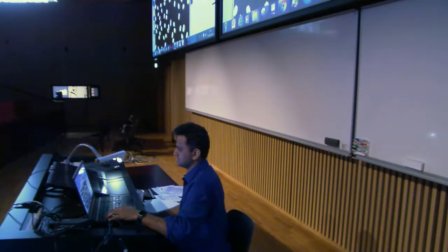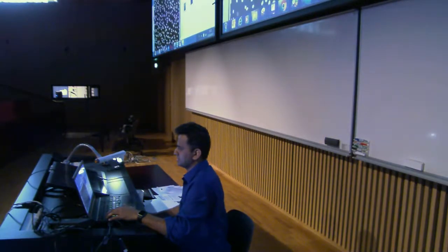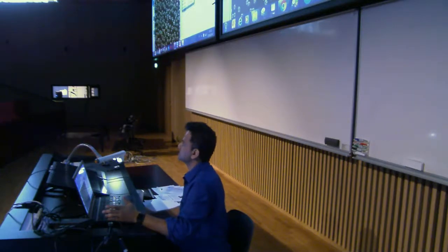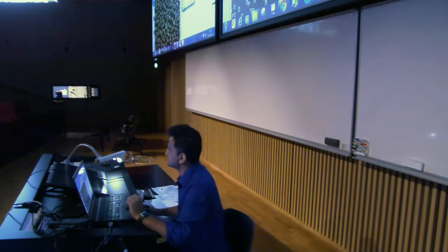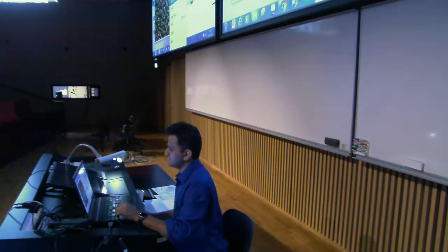And then if I just close everything, discard, open this nuclei, analyze, go to tools, ROI manager, and now here I open it. Open, go to this ROI set, and I say show all. Now it's displayed. So you can open any image and apply that ROI on that image just to see what is happening. If you want to save this for publication, of course, then just go here, file, save as, make it as PNG.